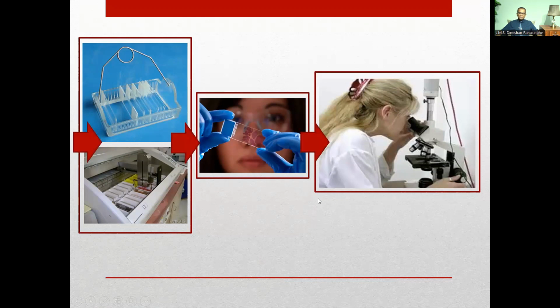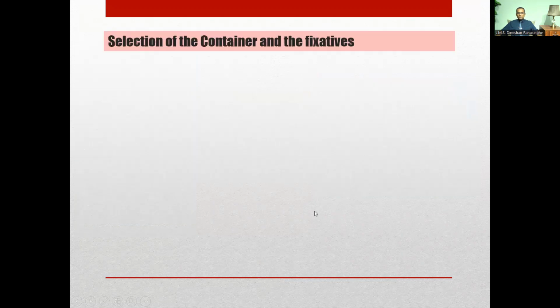So you can appreciate, I suppose, this is a longer procedure. So it takes time. It will take 1 or 2 days for the report to come in the Sri Lankan setup. But based on other issues in the lab or the infrastructure facilities available, the time can differ. So the earliest you can get a histopathology report for histology, that means for a biopsy, varies with the lab facilities available, and it can vary from usually about 2, 3, 4 days.